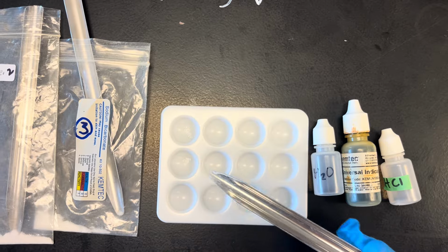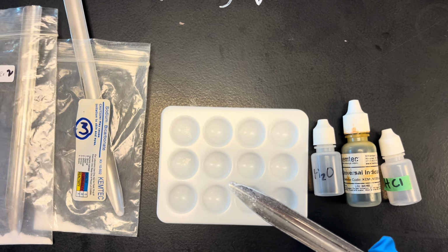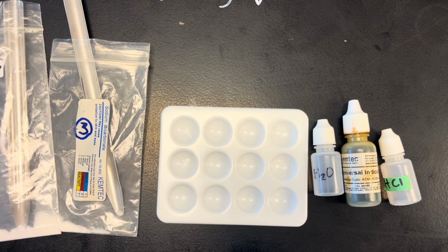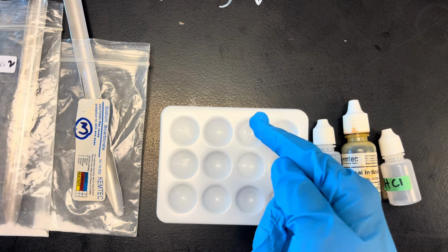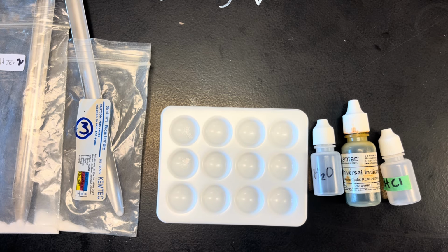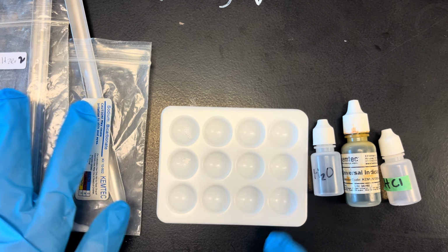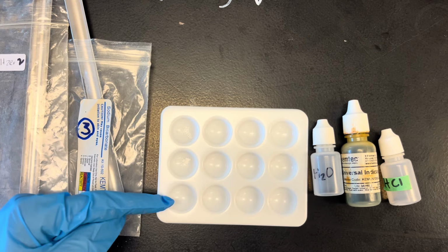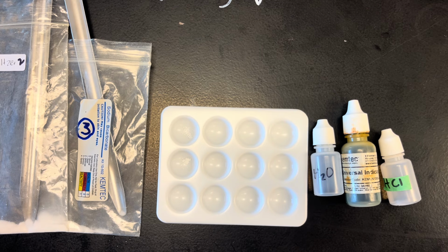And I would like you to use the smallest amount possible. So if you can see the amount of aspirin that I put there, I would then repeat that with the Alka-Seltzer in the next column and the sodium bicarbonate in the next column. So for these 3 substances, I just need 6 wells. If you make a mistake, you could use the 3rd well in that column to repeat one of the tests.